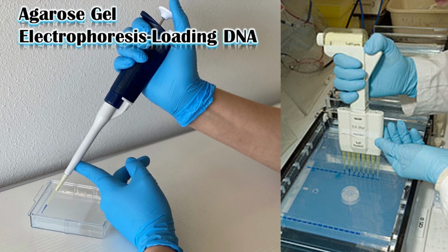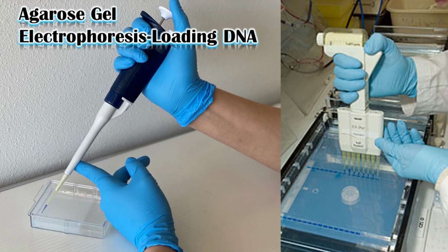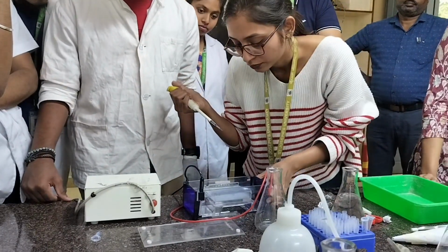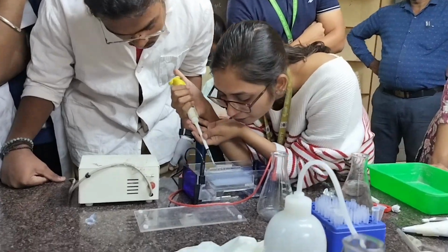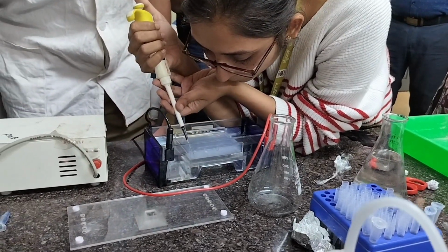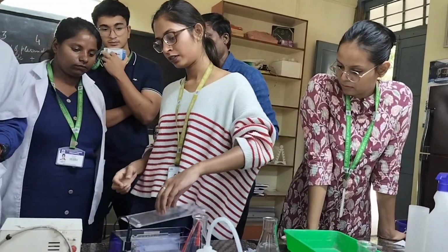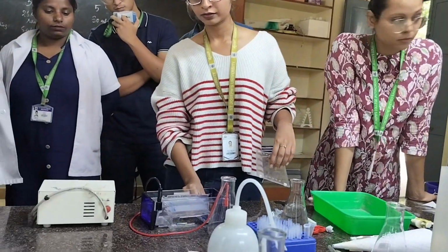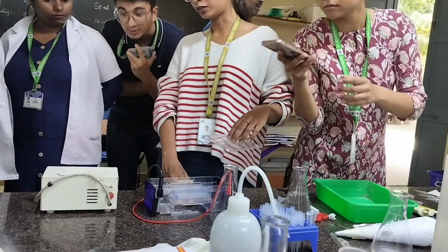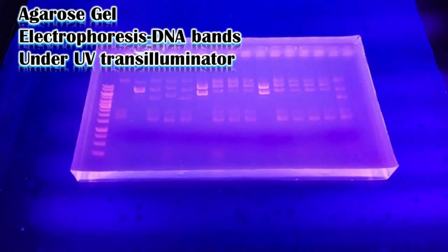Connect the power cord to the electrophoretic power supply according to the convention. The general practice is red is anode, black is cathode. Load the DNA samples in the wells in the desired order carefully, and this is very important. This loading should be done accurately, properly, without smudging. Set the voltage to 50 volts and switch on the power supply and allow the dye to run on the gel and observe the dye that is moving on the gel. Switch off the power of the electrophoresis unit once the process of electrophoresis is complete, that is, bromophenol blue reaches till almost the end of the gel.